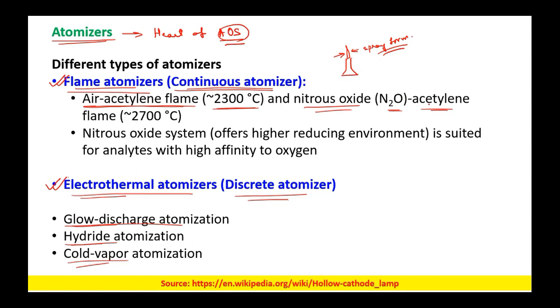acetylene flame. Okay, so this nitrous oxide acetylene flame gives us a more reducing environment as compared to the air acetylene flame.